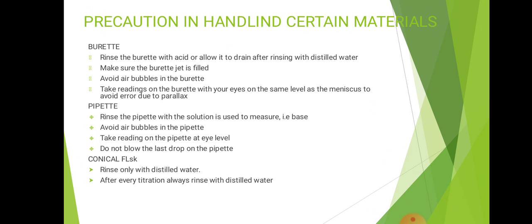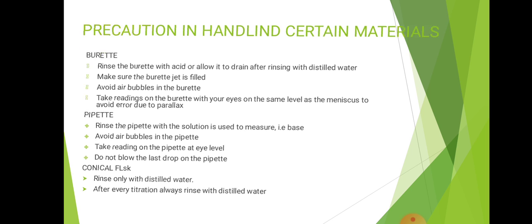You don't have to rinse with base, neither do you have to rinse with an acid. You only rinse with distilled water. And also, after every titration, rinse with distilled water before you carry out another experiment. Please, let's take note of this. It is very, very important.